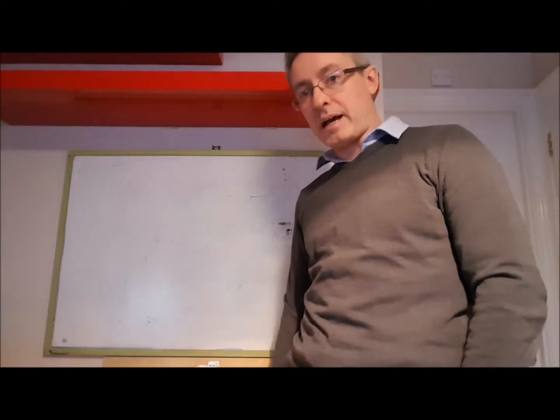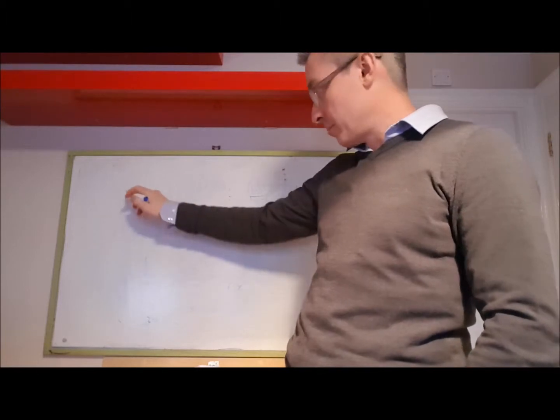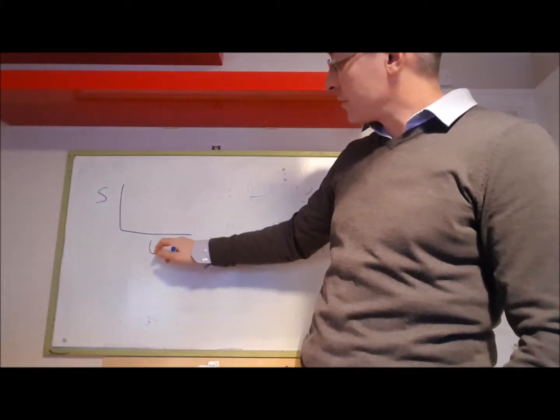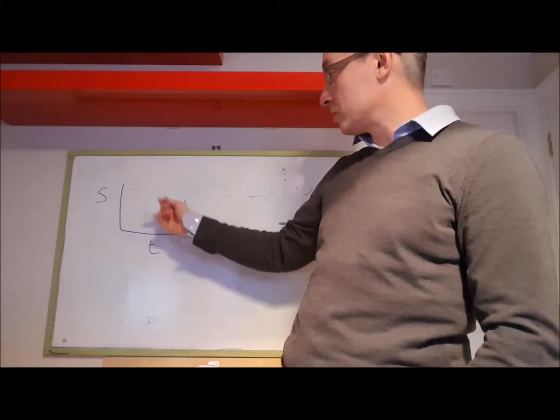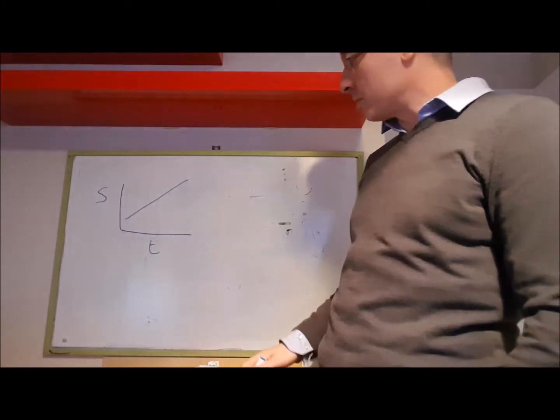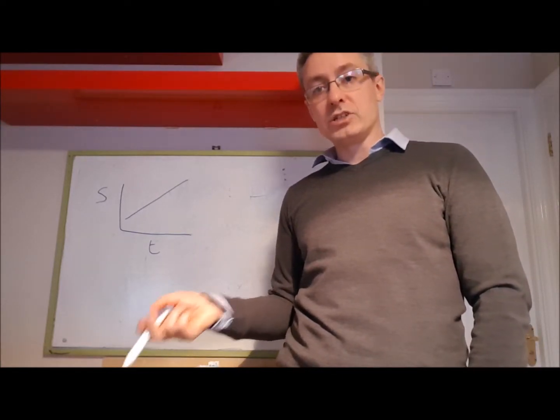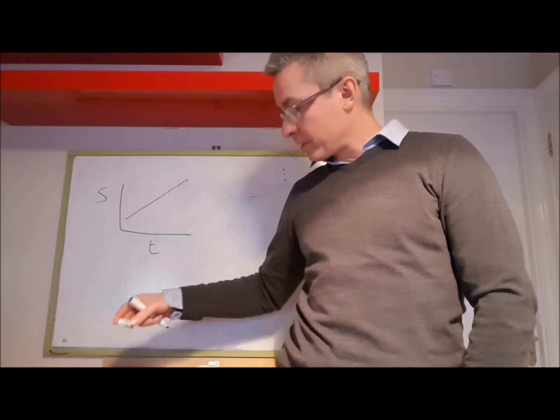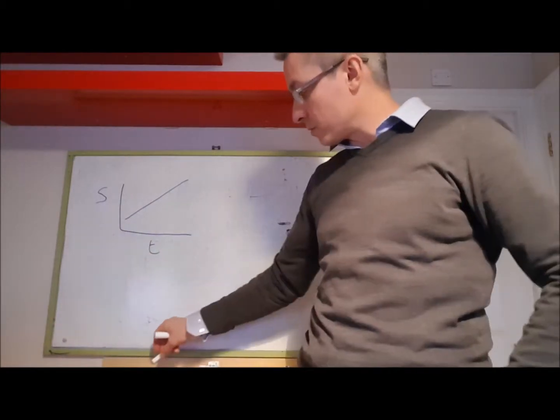I'd sketch up the kind of thing that I would expect. If I was monitoring an engine when the oil was fresh, maybe I would expect a sort of signal, conductivity if you want to call it that, with time. Maybe as the metal content went up, the conductivity of those solutions might also go up as well. So you kind of get this trending upwards. So maybe looking at the conductivity or impedance or resistance of engine oils is a way of monitoring them using these types of electrodes, and they're parallel electrodes, they're just in a spiral, would be a way of doing conductivity.